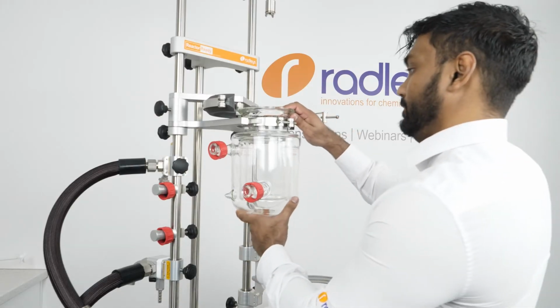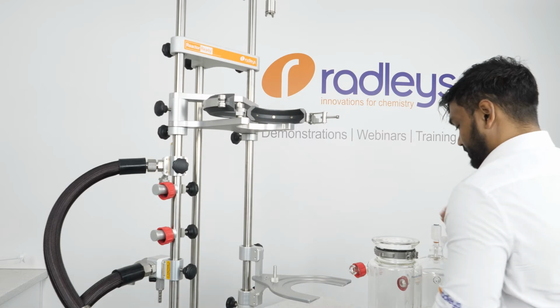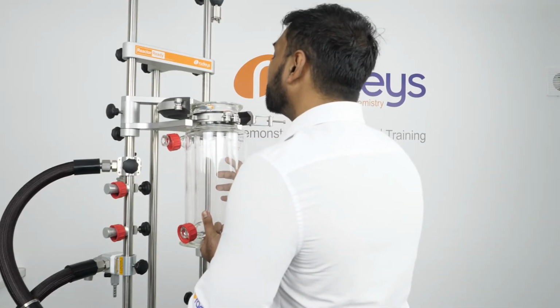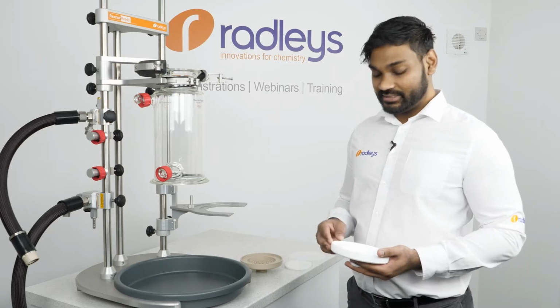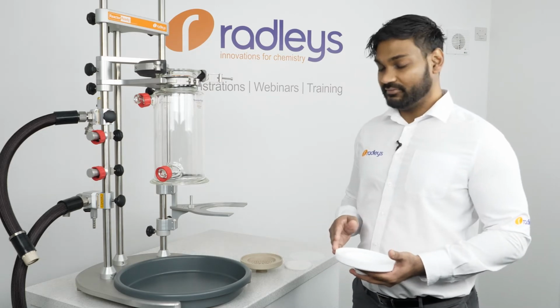Filter vessels have the same neck size as our standard and process Reactor-Ready vessels, so they fit into the vessel support in exactly the same way. We can load the vessel into the framework by simply locating the vessel collar into the vessel support. We then assemble our filter base, so the filter bases can be made out of PTFE or PEEK. I'm using the PTFE one here.